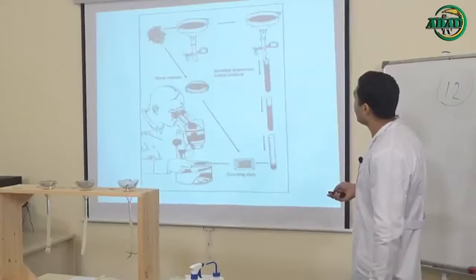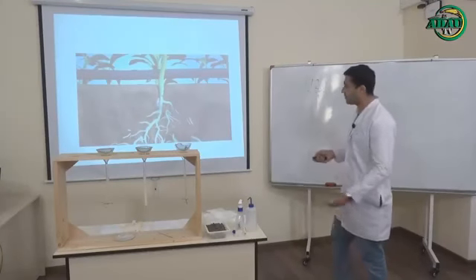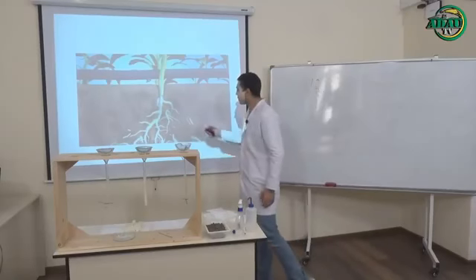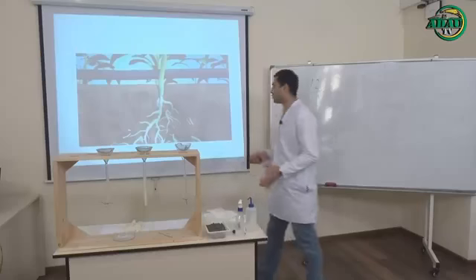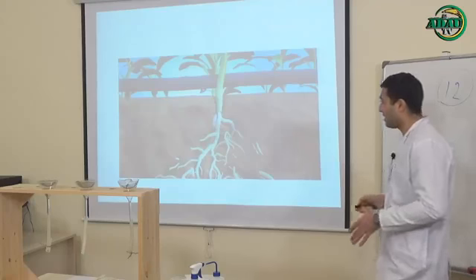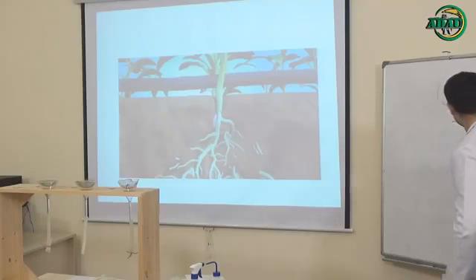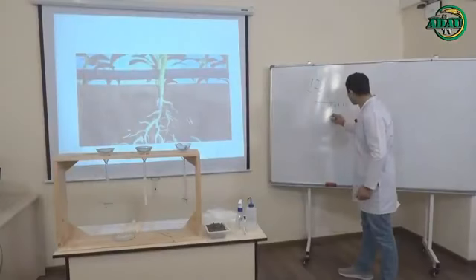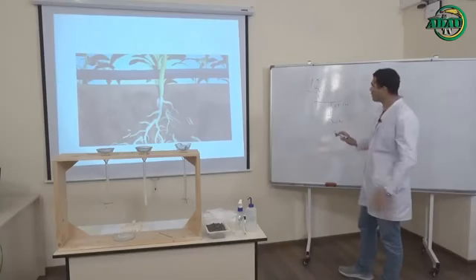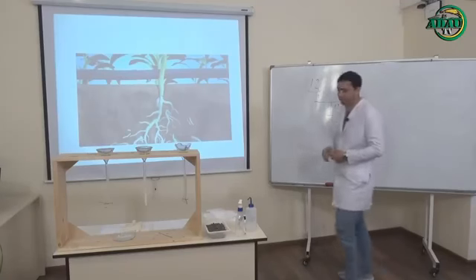And where can we take the soil samples? Actually, nematodes live around the roots. If you want to take these samples from soil, from crop plants, you have to take the soil from 15 centimeters or sometimes 30 centimeters depth. You can see all these nematodes live at these depths, actually around the roots.